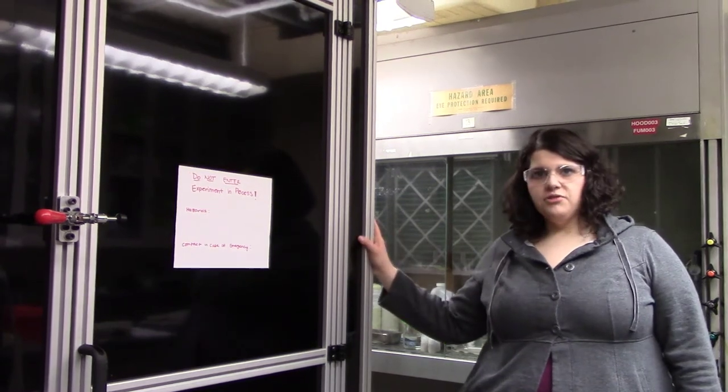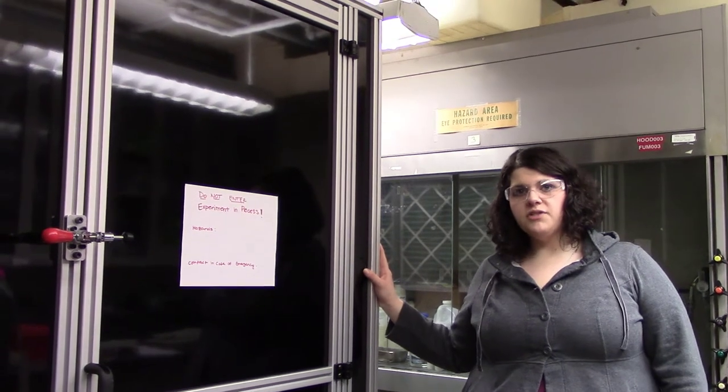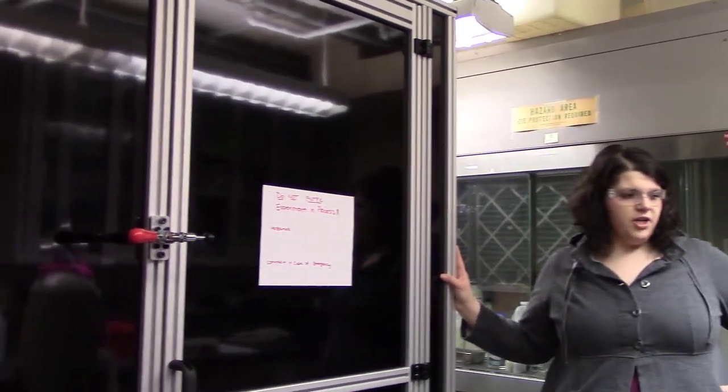I'm Hannah Kelp. I'm a PhD student and research assistant here at the University of Minnesota environmental health program. My work primarily down here is with the Exposure Science and Sustainability Institute. One of the tools we primarily use in ESSI is our environmental chamber, and in our chamber we can simulate and measure exposures to answer questions from industry.